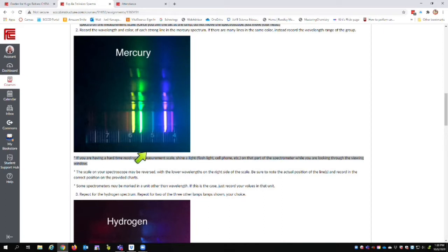So let's just take this one right here. So there's 450. This is 400, so this line's 410, that line is 420, and so we're just going to do the best we can, thinking, well, maybe it's a little bit above 410, I don't know, maybe call it 412, but if you called it 410, that would be fine as well. So we're going to record that as the measured wavelength for that purple line.